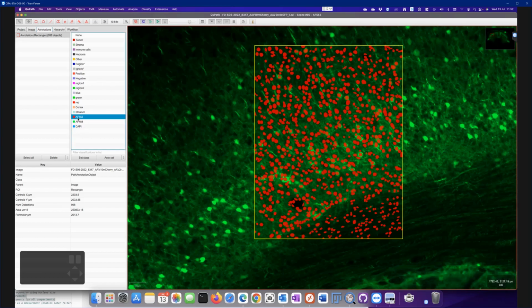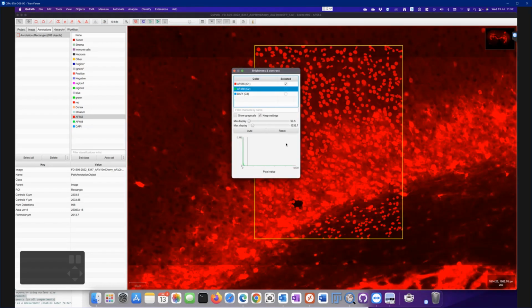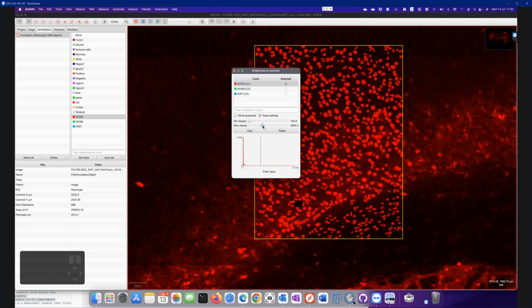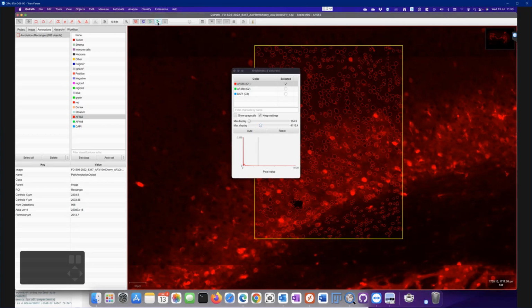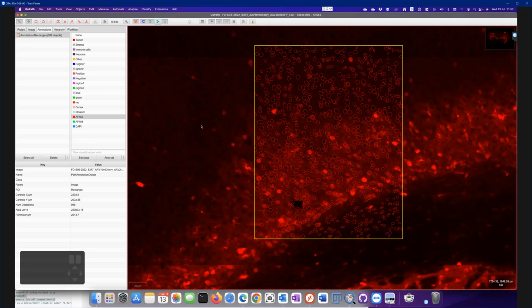We will now do the same with the other channel. So the red, actually, like this. So this is a bit too harsh, as I said. We need to tone this down a bit. Okay. And also here I don't want to fill the annotations, if not I won't see anything. Something like this works for me, so you can just close this.